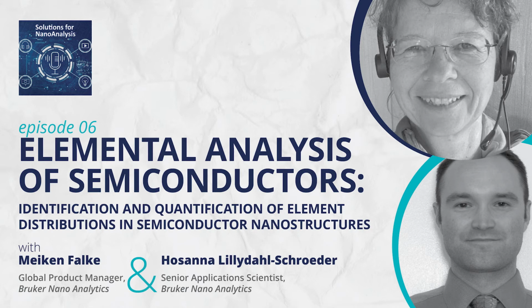In EELS, however, the complete energy loss of the electron is analyzed. So that means the electron loses energy in many different processes, and only one of these processes is the emission of characteristic X-rays, which EDS looks at. EELS has hidden within itself a much more complicated collection of effects, which we can see in the EELS background.